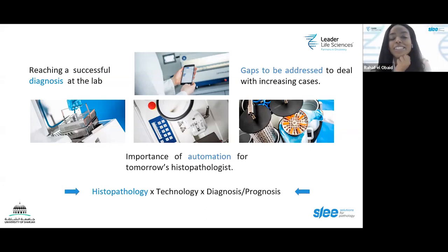Absolutely. I definitely understand your point, and dealing with manual equipment first, from my personal experience, definitely taught me a lot. I didn't even know that there were automated microtomes and automated stainers. We had to go through the whole process, which makes it stick in your head. So I definitely agree with you. But I would also like to give Alex the same question. Since SLEE is a pioneer at manufacturing automated histopathology technology, do you have a different point of view that you can shed light on?